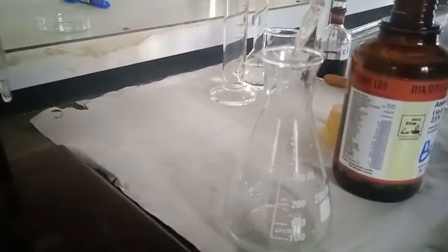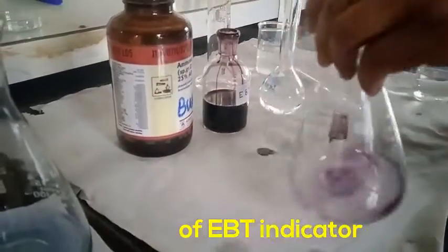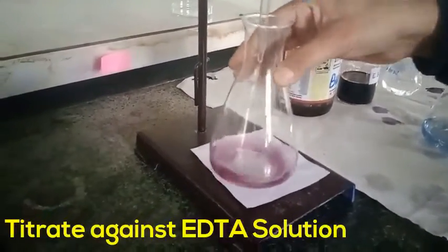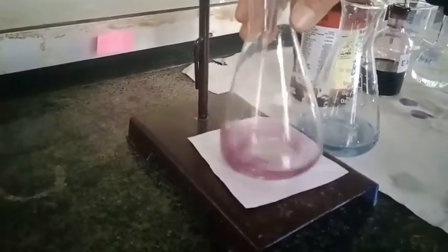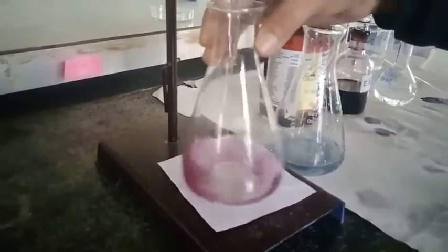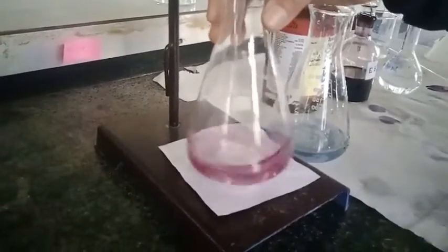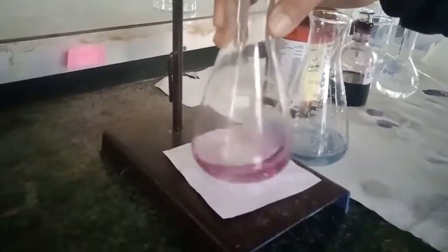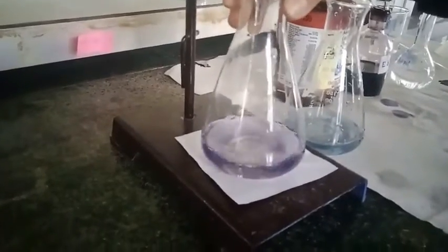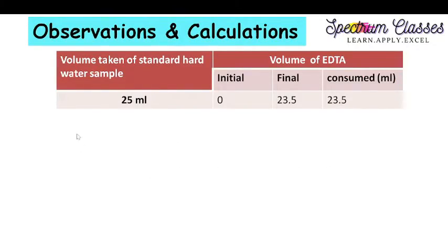Here I have added basic buffer — also called ammoniacal buffer — to the hard water solution. After that, I am going to add 2–3 drops of EBT indicator, which is an internal indicator and gives a wine red color. Now I am going to titrate it. To determine the end point, I have kept a reference solution. We are about to reach our end point — and here you can see the end point. The final reading of the burette is 23.5.